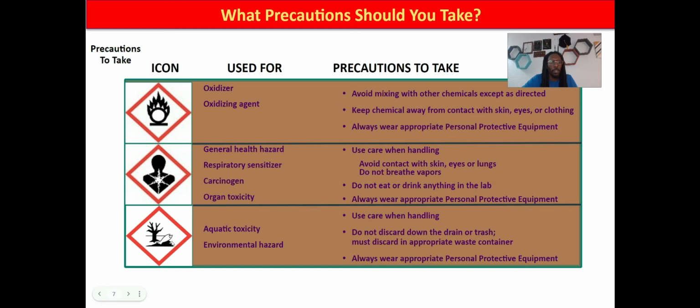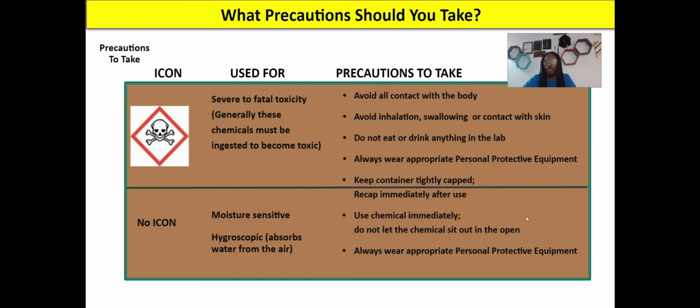This one with the dead fish. This is basically an environmental hazard. So you're going to be careful when you're handling this. And you don't want to just throw this down the drain, because that's going to impact the environment. So it's going to defeat the point. And then you're going to have on your PPE. Like I said, with all these you really need to have on PPE.